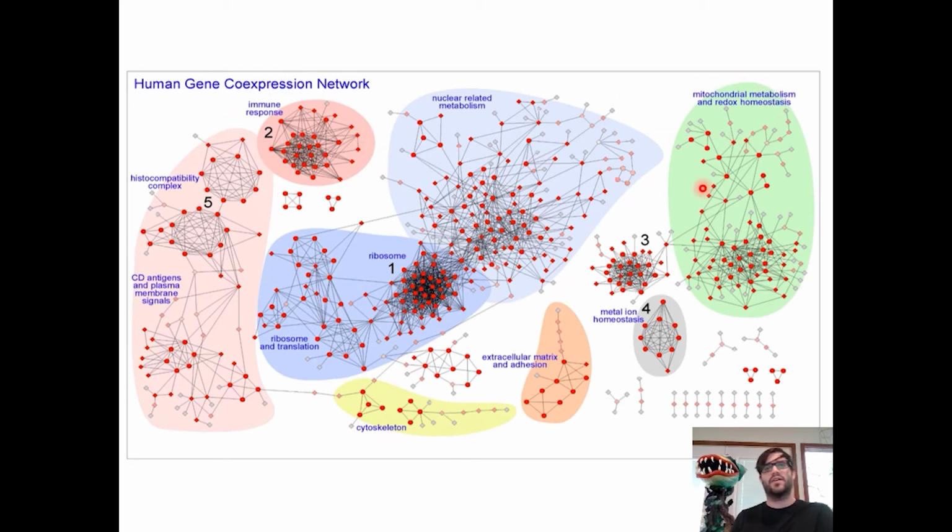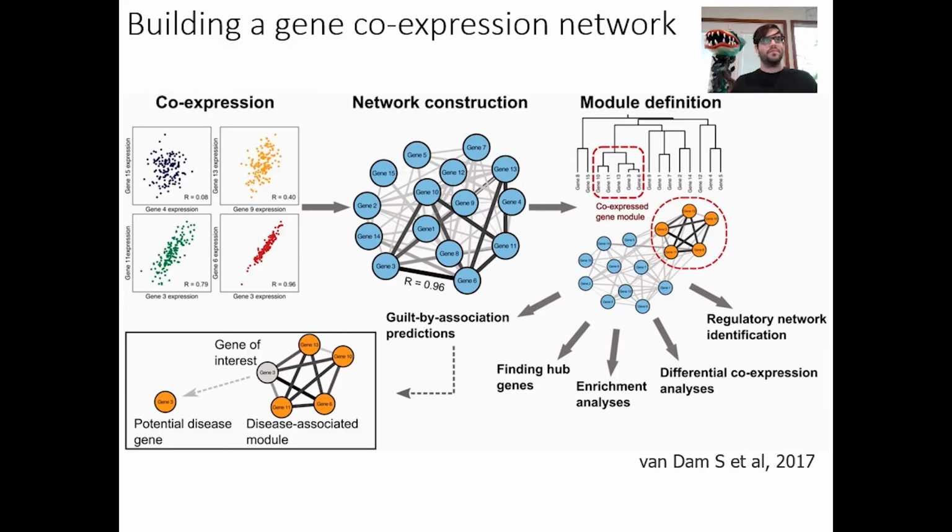What we could do here is run this co-expression analysis, and if we're interested in immune responses, we could then see how these genes are associated with each other in some downstream analysis. Again, this is another representation that's a little bit more defined.